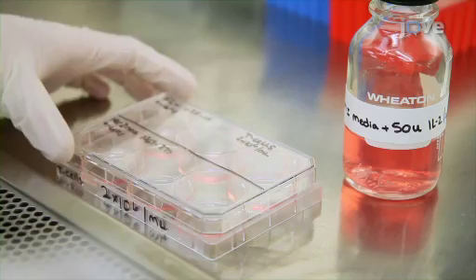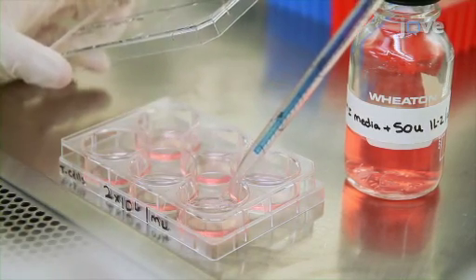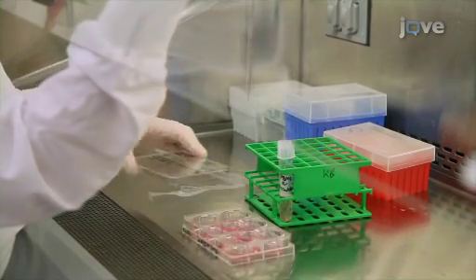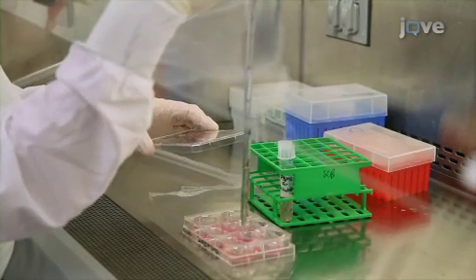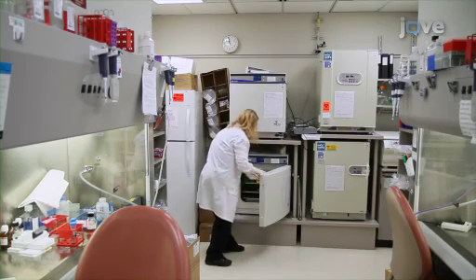Continue adding fresh media supplemented with IL-2 on alternate days. After another week, restimulate the cultures in the same manner a second time. After six more days in culture, the cells will be ready for use.